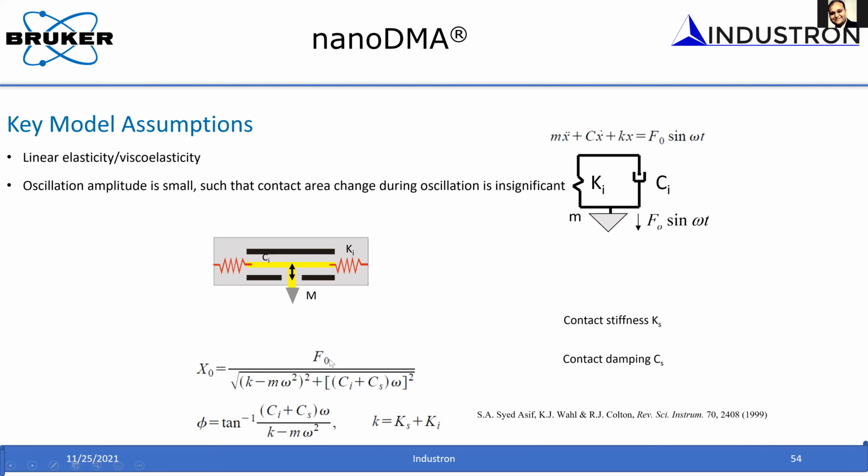So you know what the force is that you are applying, because that's the quantity that you're applying. This is the displacement amplitude you can directly measure from the lock-in amplifier. These are all the constants that I mentioned. K is the stiffness of the transducer spring that I showed schematically here. And you know the mass of the transducer, and the damping coefficient is something that you can calculate through this calibration. So once we know all these parameters of the transducer and the electronics, you can measure the response by making the contact, the tip in contact with the sample. And then, as in the previous example that I showed, you can measure the response.